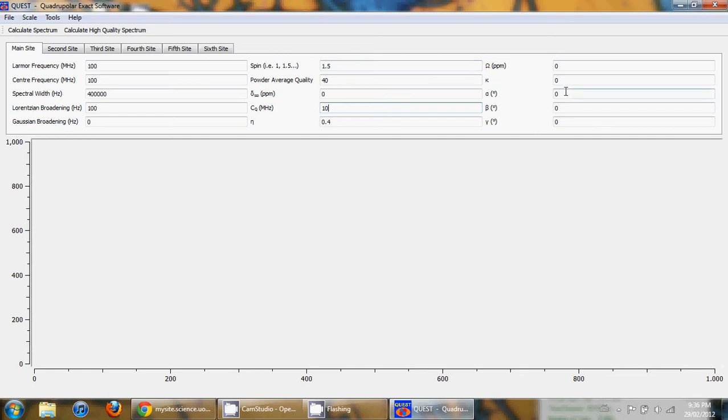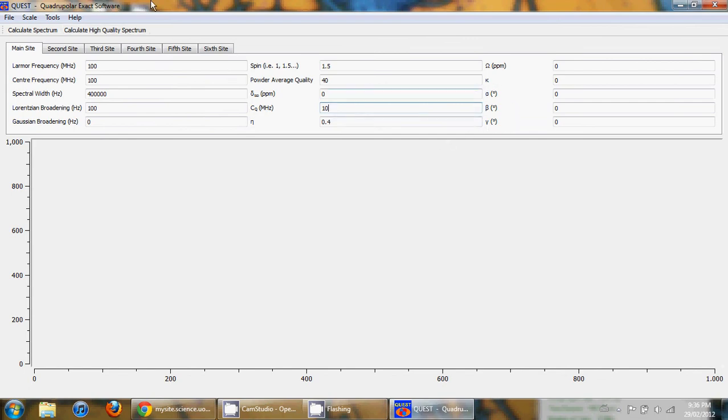You can also change the relative orientation of the chemical shift tensor with respect to the electric field gradient tensor with the use of three Euler angles alpha, beta, and gamma. But I will discuss the theory and the different parameters more in the second tutorial.